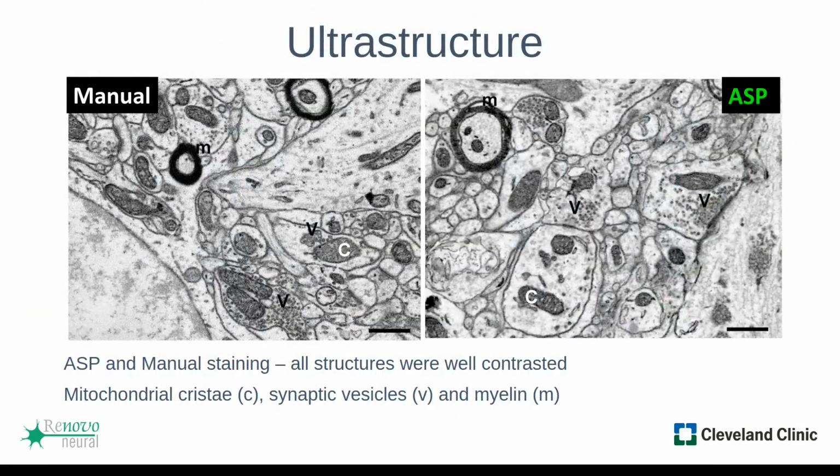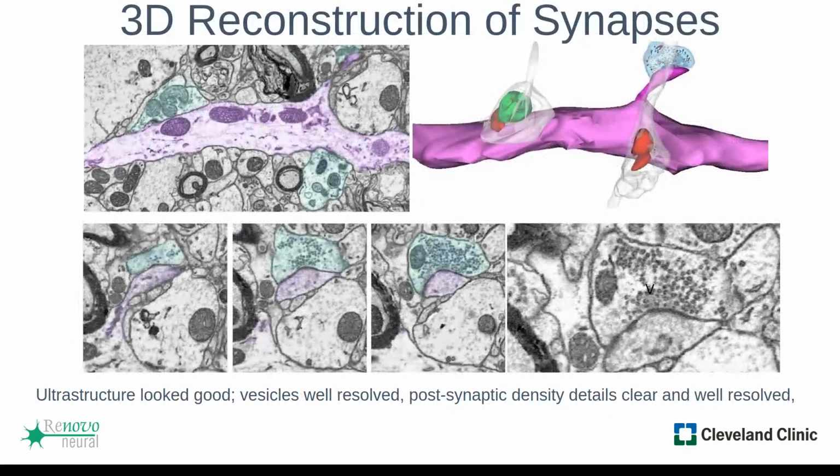We did it as a within-animal experiment, but we could expand it, because having 1 animal answered the question that we really wanted to know: does using the system change anything between this 1 animal, where it's 1 slice of tissue versus the next chunk of tissue that we stained? I'm still going to go to the slide, sorry about that. I think it's the next slide.